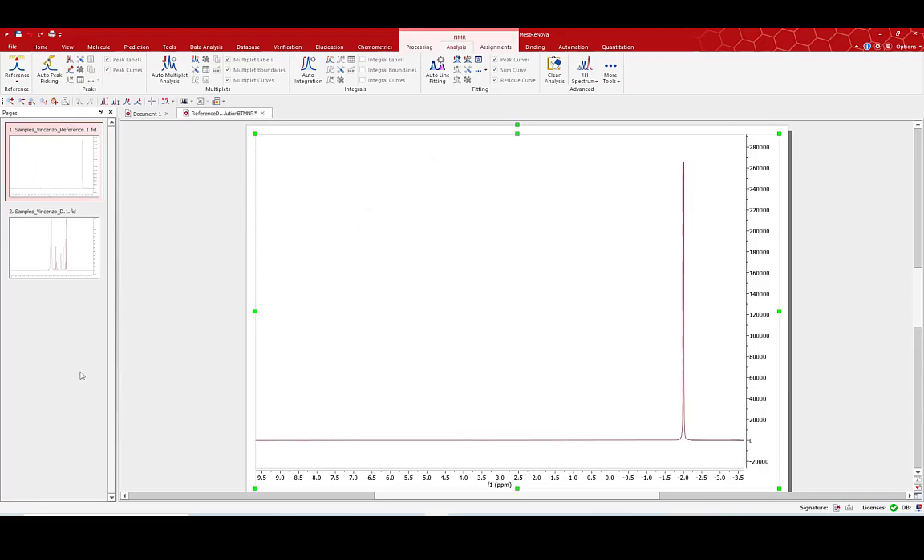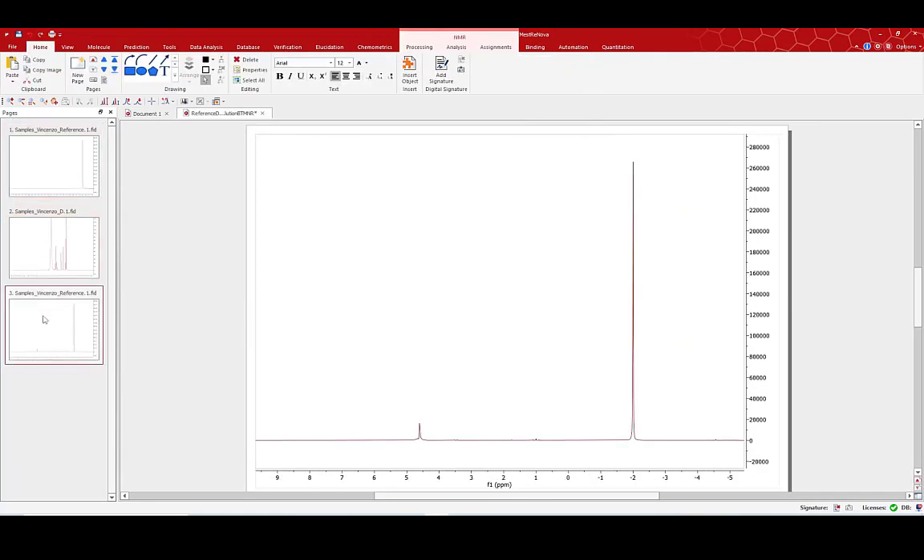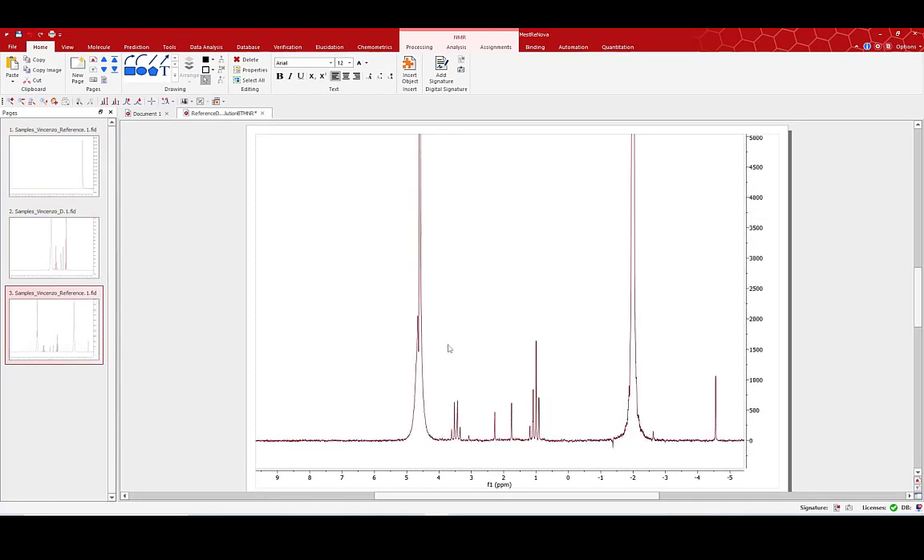Now I need to combine my spectra into a composite spectrum. Selecting both spectra, from the analysis tool I can use the arithmetic option to add the two spectra. Now I have a composite spectrum containing my reference peak and my peaks of interest.